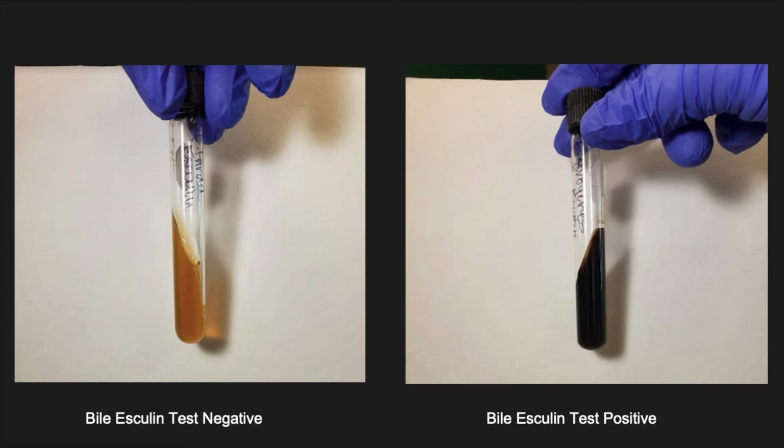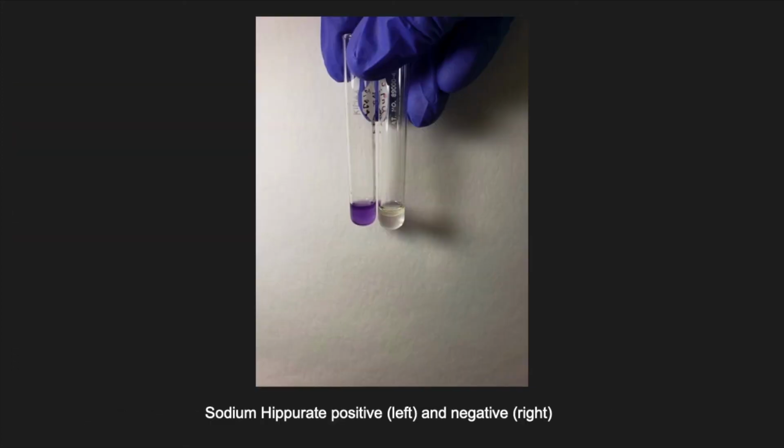And this last slide here is just showing you the different results for sodium hippurate positive and negative test after adding our ninhydrin reagent. And what this shows is on the left we have the color change to purple, indicating that a positive test has occurred, and on the right we have the negative test. That's all I have for this one.